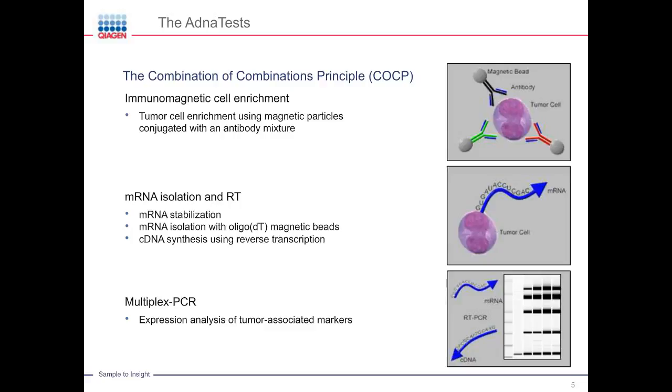It is actually starting with something you might already know. It's immunomagnetic capturing in a first instance that we use to enrich the cells from the blood of a patient. Enrichment means, by the way, here that it is not pure CTCs you get out. We will come later to that because it's one of the challenges that we always have, whatever method you are looking at. There you have a contamination of a certain amount of leukocytes which needs to be addressed and needs to be taken into consideration if we think about molecular characterization of such cells.